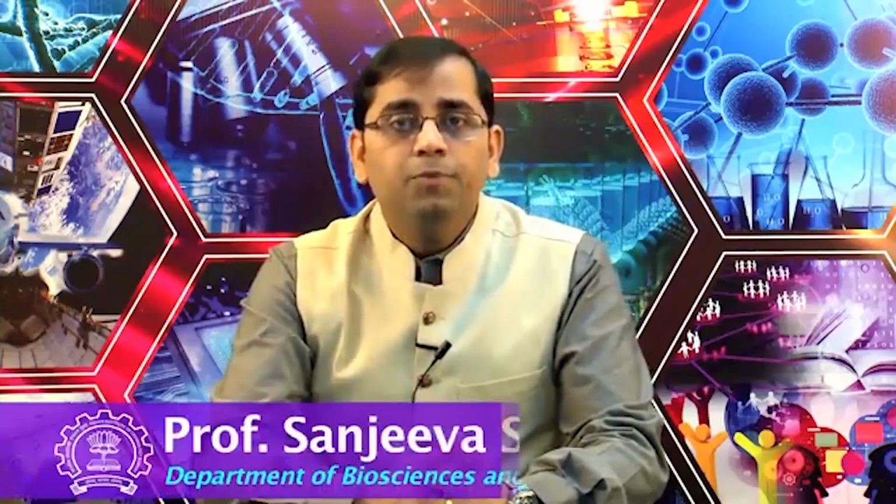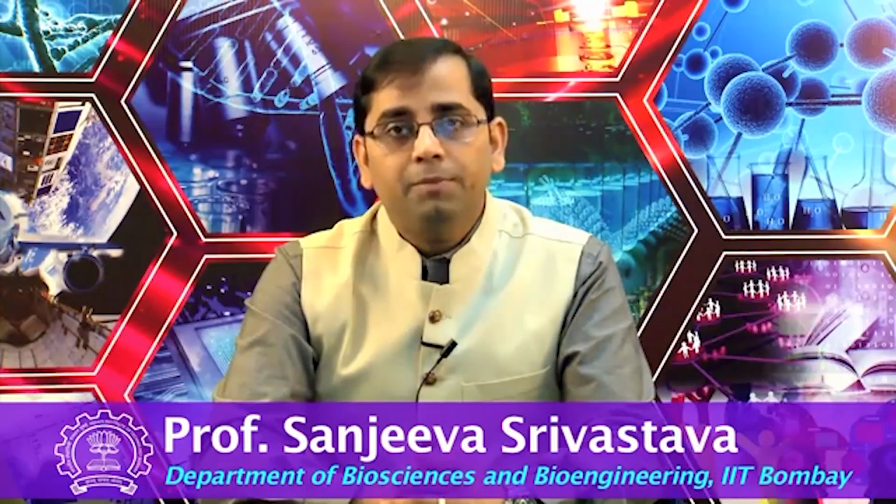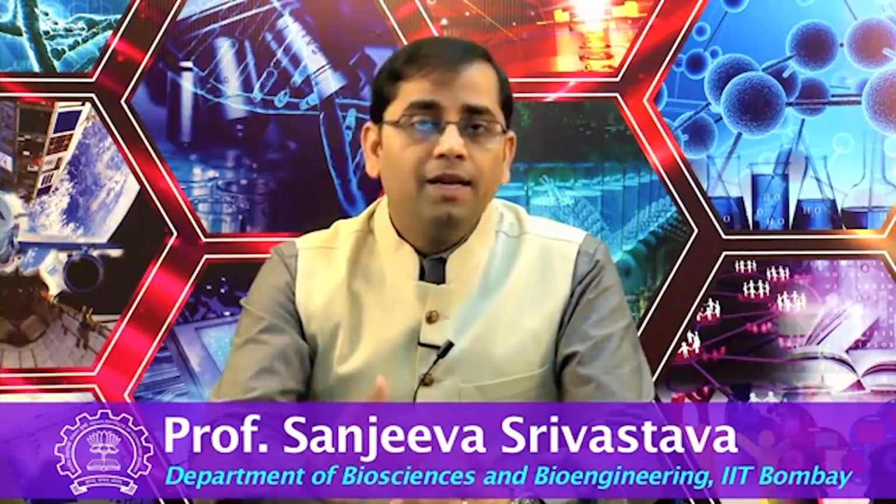In today's lecture, we are going to talk about the basics of mass spectrometry, which could be used for characterizing and identifying the proteins of interest after performing the immunoprecipitation based experiment. In the last lecture, if you recall, we talked about how, if you want to identify the potential interactors of a protein of interest, you can do an immunoprecipitation experiment and then identify the potential interactors using mass spectrometry.